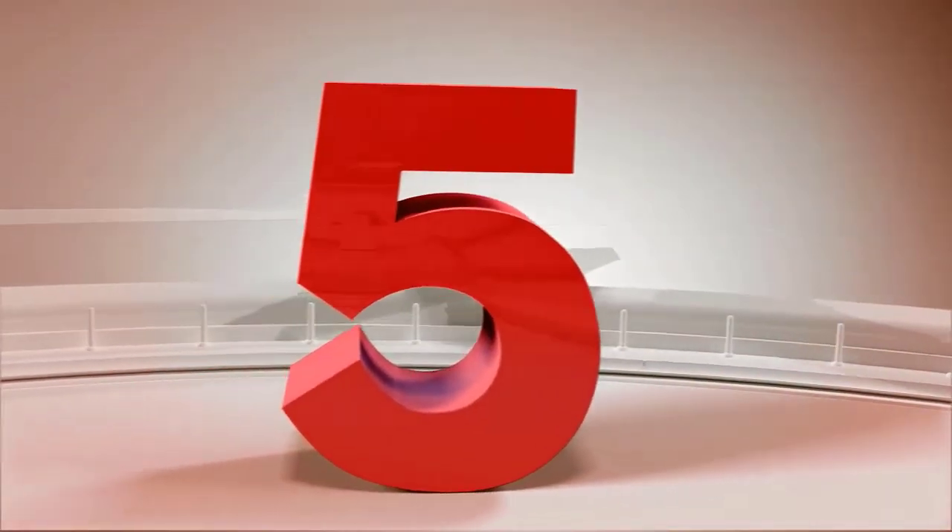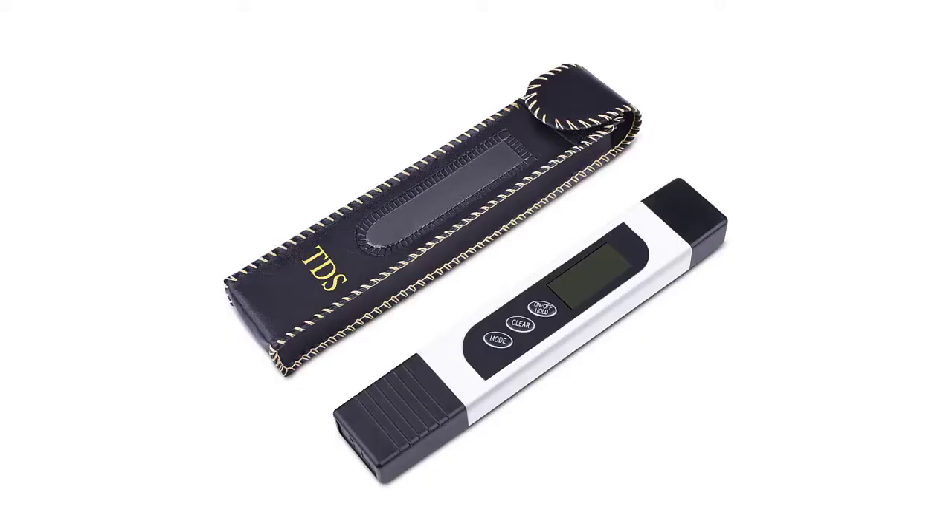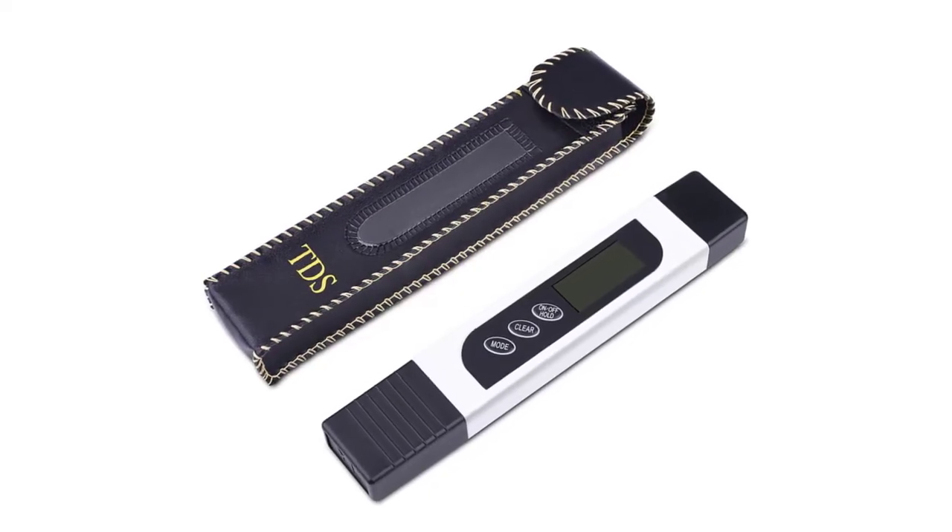Number 5: M-Digital TDS Easy Water Quality TDS Tester — a plastic, 100% imported economy model that is ideal for end users. Highly efficient and accurate due to its advanced microprocessor technology.